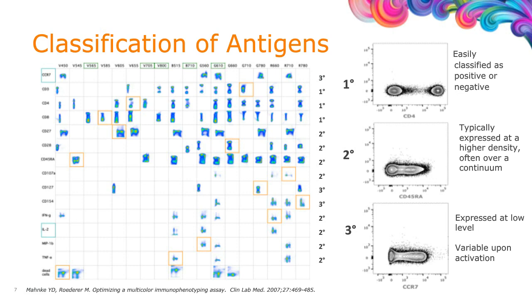And Mario and Yolanda built this table that shows multiple different colors against multiple specificities and then categorize them in a way to know if they're primary, secondary, or tertiary. And it's always intrigued me that those three types of receptors, if we look at them from that way, help us in defining what colors we do use.